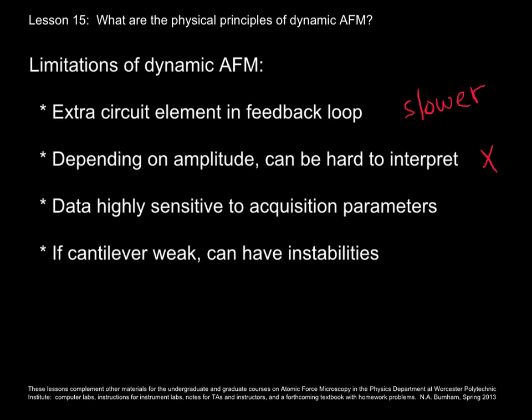Because it's a resonant technique, the data are very sensitive to data acquisition parameters, so be careful to use exactly the same parameters if you need to compare samples. And if the cantilever is weak, there can be sudden jumps as you move from spot to spot. And that's fairly complicated and best left for an advanced lesson someday.